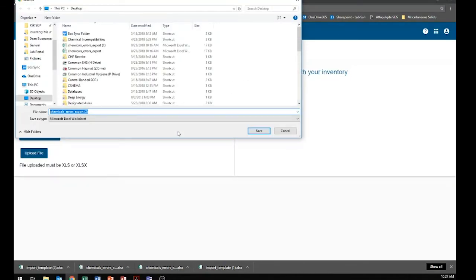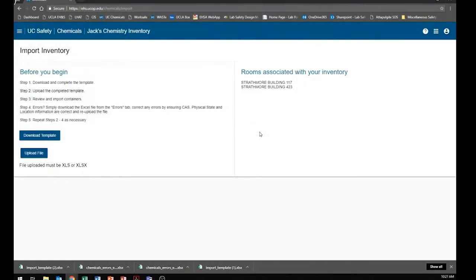So I'm downloading the errors now, and that means that I can go back to that for error reconciliation, so I get those last 4 items into my inventory. That will actually be the next topic for the upcoming tutorial.